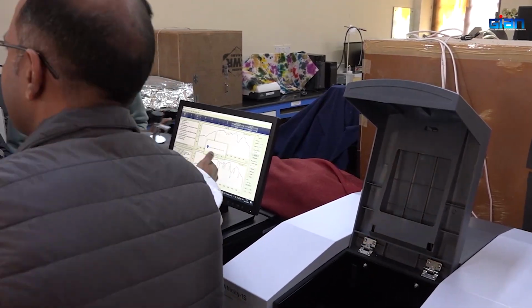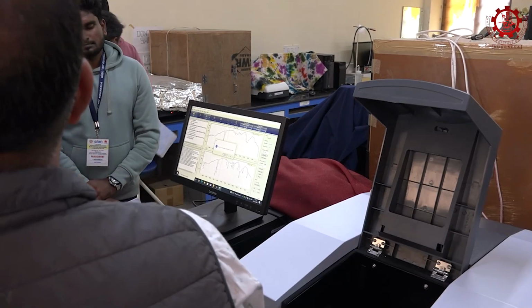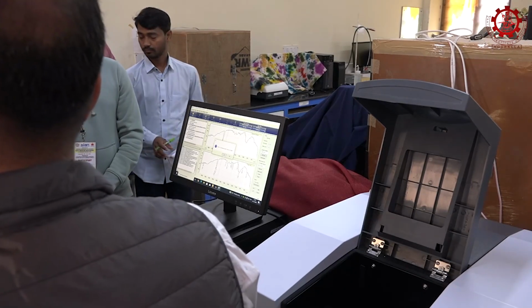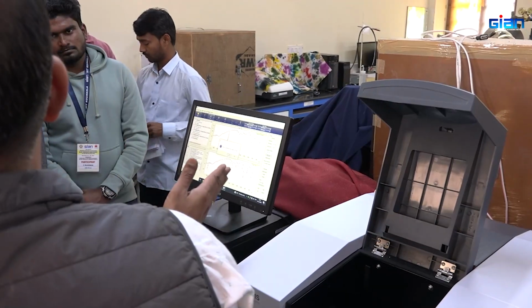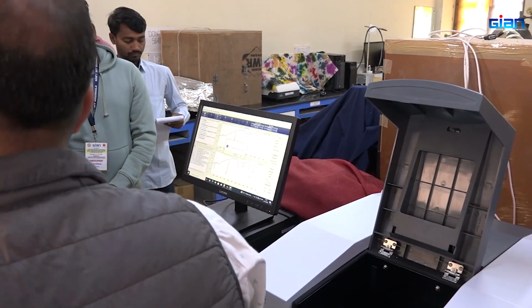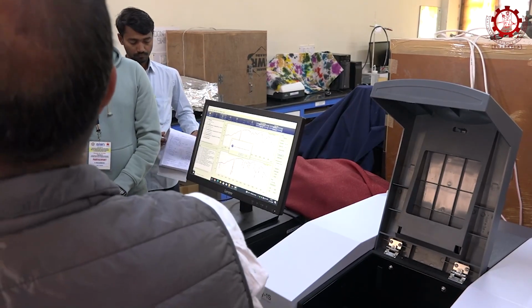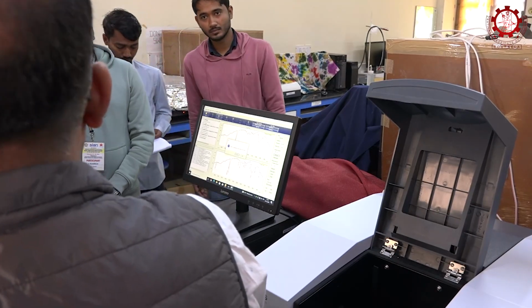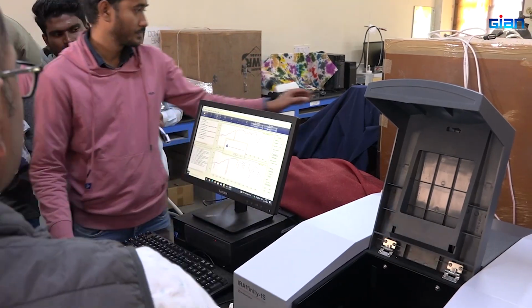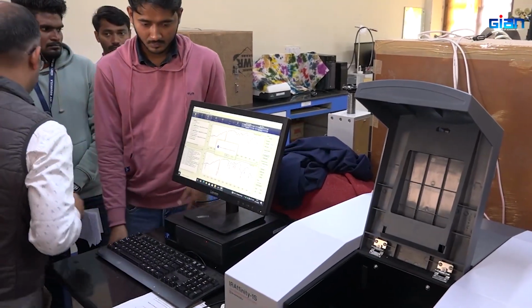in this region. So now what is done is you take potassium bromide, it is a solid compound, you know sodium chloride, which is salt. Similarly, potassium bromide is another salt. So you take your compound, mix it with potassium bromide, you really grind it, make it uniform, and then we have this pellet. Yes. So we can show here.